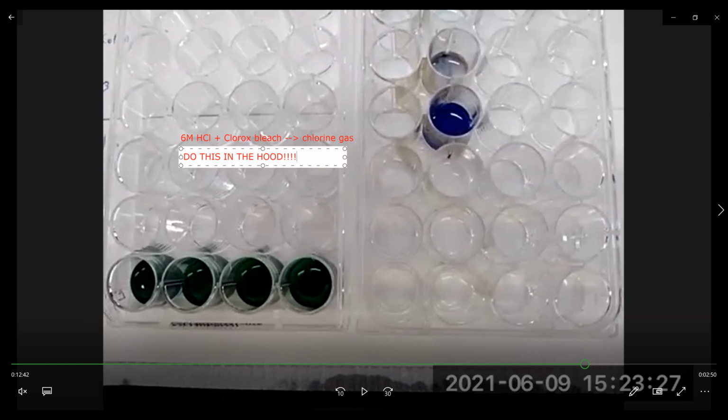It takes a minute or 2. You add your 6 molar HCl to the Clorox bleach. Give it a few minutes, observe any reactions. Once you see if any bubbles have formed, you can move it back to your bench. But this part should be done in the hood because when you mix HCl and Clorox bleach, the HCl reacts with the sodium hypochlorite and forms tiny amounts of chlorine gas. So make sure you do this step in the hood.